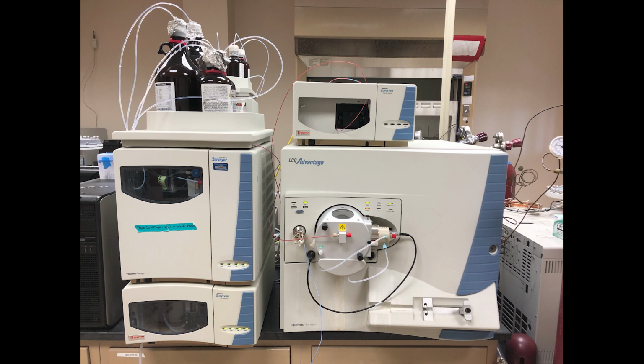And this is going to be your primary workhorse next semester. This is what you're going to use for LCMS and toxicology. It was donated by the medical examiner's office. It was actually the instrument that they used to run their cocaine quants on. So let's use this instrument as an example, and let's walk through it in a little bit more detail.